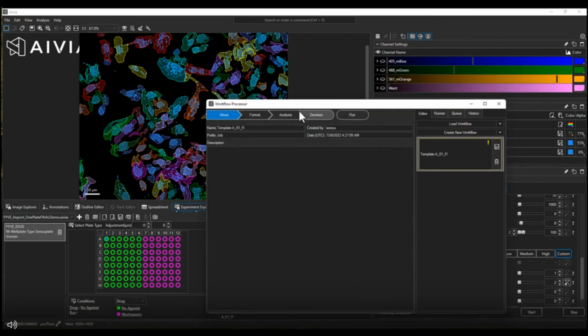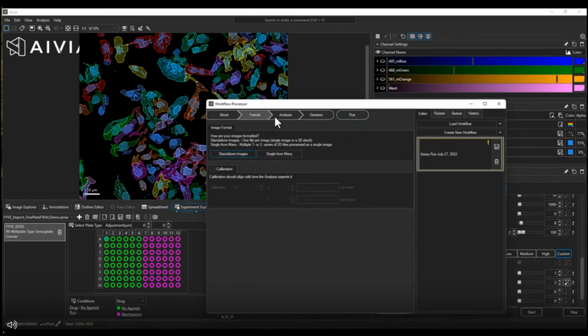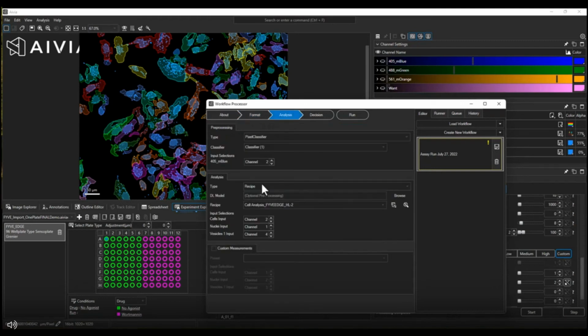This is where you could put your notes about the experimental conditions. In this case, I'm changing the name of the workflow file. I am changing the name of each analysis as a field of view. I'm also inputting my name there. This is a step where you input a number of different conditions that went into doing your analysis. By creating the workflow, by right-clicking on the object, it's auto-filled in for you, which is a very nice feature.